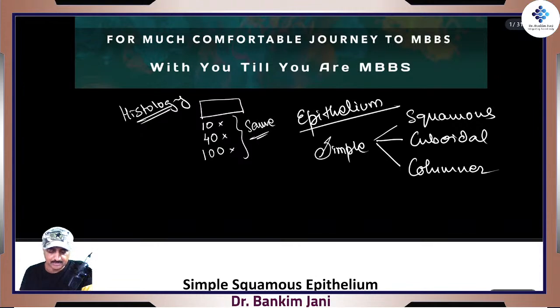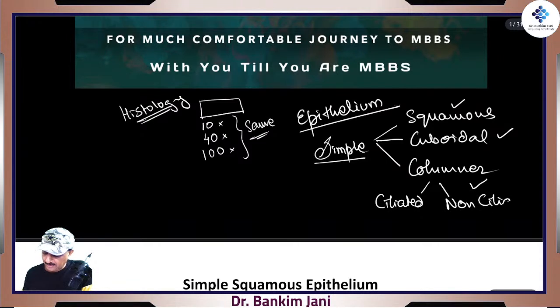Now what really happens when we watch it in books? One image is given to us. So at times we never get the real context of how large it is or where exactly that particular tissue is found. We shall be watching all three of them. Will not be worrying much about the stratified today. But in the columnar part, we'll surely be watching ciliated and non-ciliated. Trust me, within next half an hour, your concept would be absolutely clean about this part of histology. So let's start.